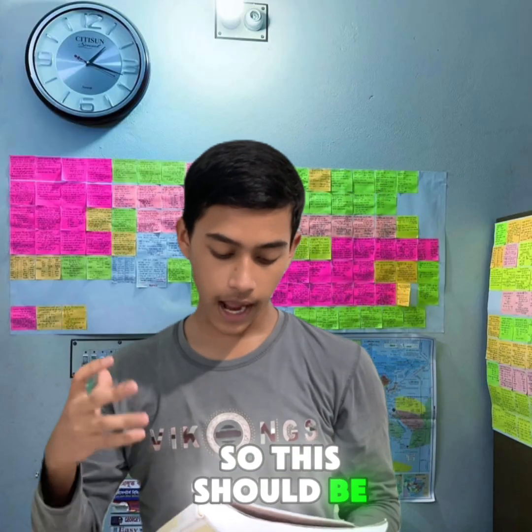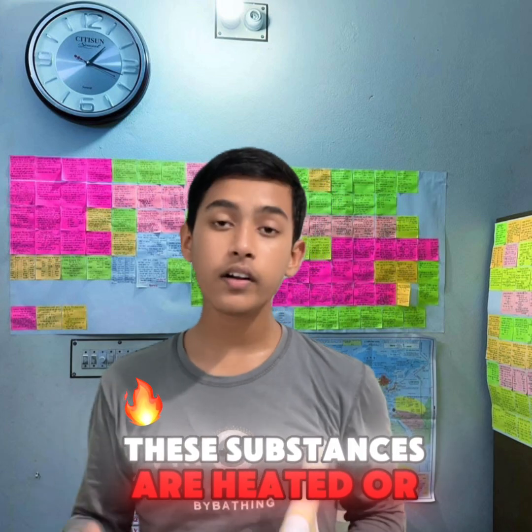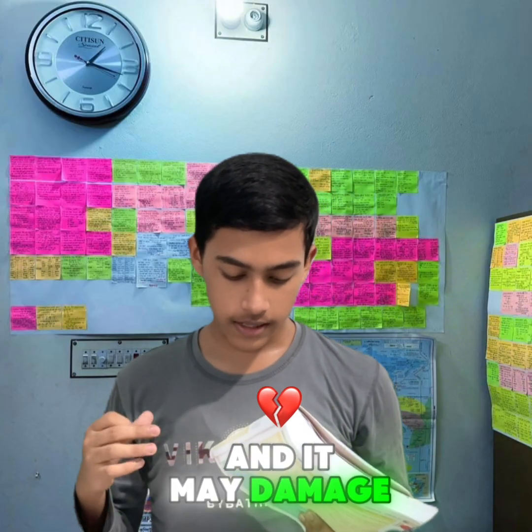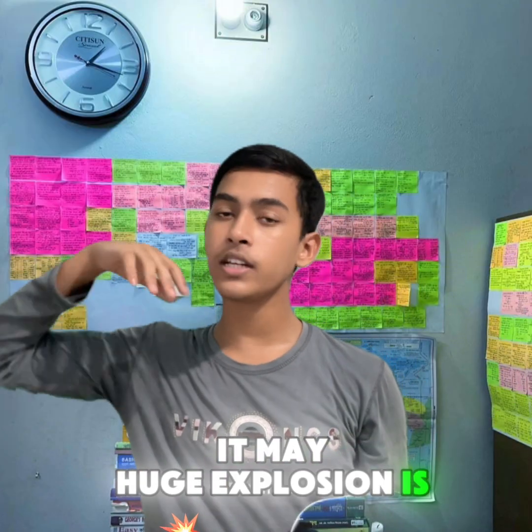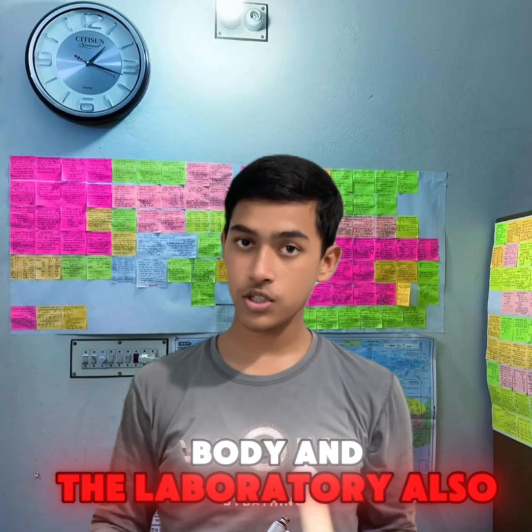So this should be handled very carefully. The risk is that if these substances are heated or ignited, they might cause huge destruction and damage the body and the laboratory. We know the experiments are held in the laboratory. If TNT is heated, a huge explosion can happen which can destroy our body and the laboratory also.